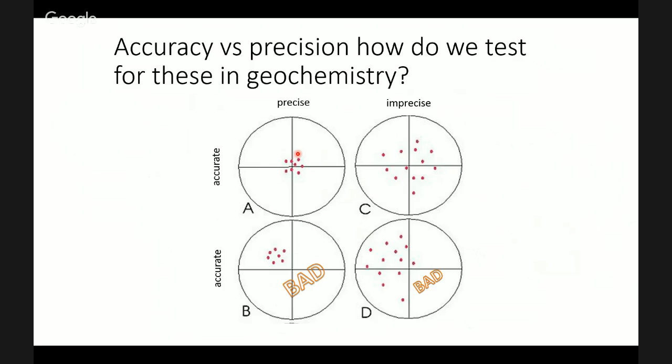If you had to do some sample processing, you might get one sample and split that into many parts and do sample processing on that a number of times. That might give you another measure of precision that includes all of the errors that you might introduce when you make mistakes in the lab. But I guess a good thing to do is to be precise, okay, but also to get the right number.